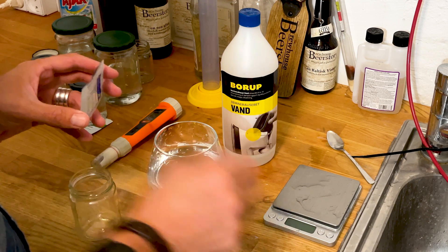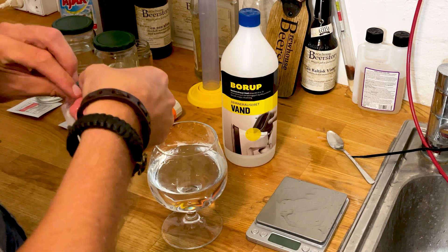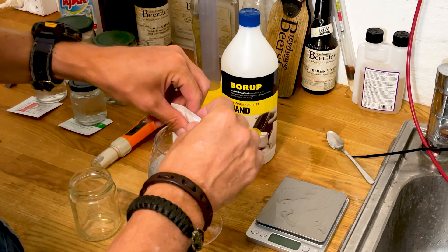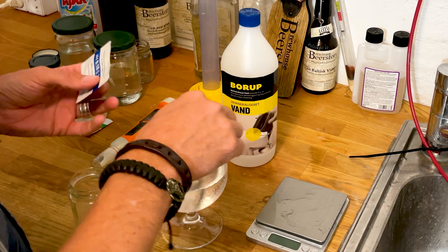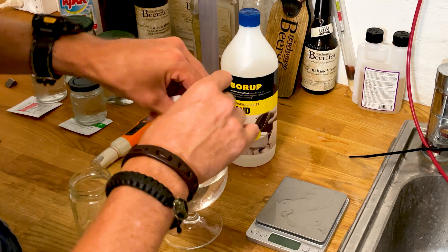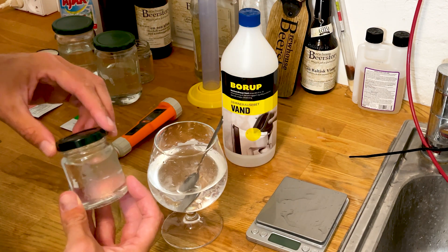I just weighed it out — one milliliter is one gram. Then I put the powder in here and stir it until it's fully dissolved. When it's fully dissolved I put it into these glasses.